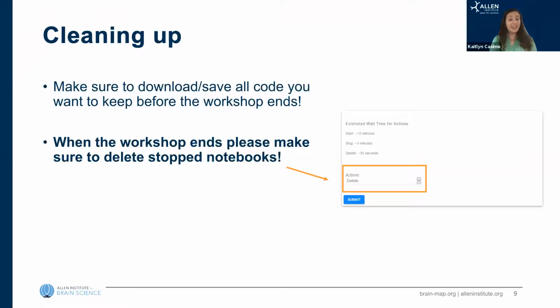Saskia, anything to add to that? No, I think that covers it. If you're not going to be using the notebook for a while, I would suggest stopping it. And when you're done, delete it, just because the instances cost money. This will only be available for a little while. So if in the rest of the day you want to keep looking at the notebooks and trying some new things, by all means do it. Feel free to download the notebooks. I pointed you to the GitHub repo where you can just access the notebooks directly. And there are solution sets for both the Neuropixels and the 2P that have everything already filled in.